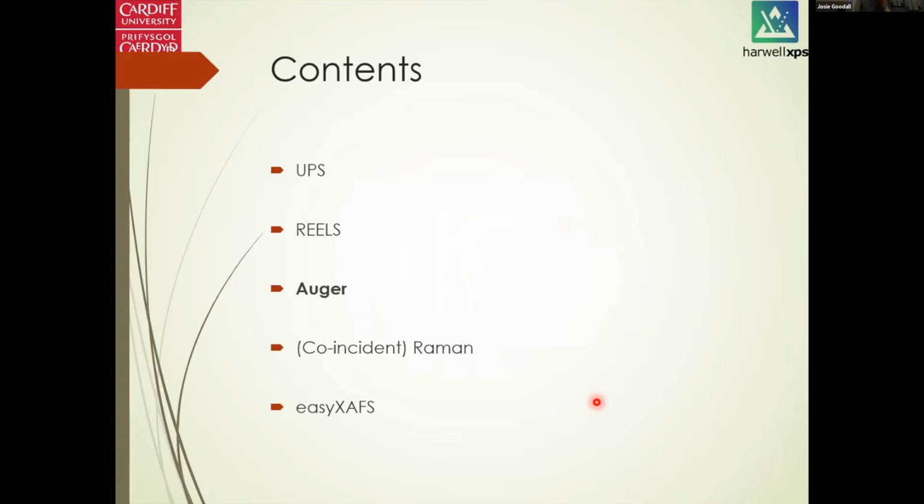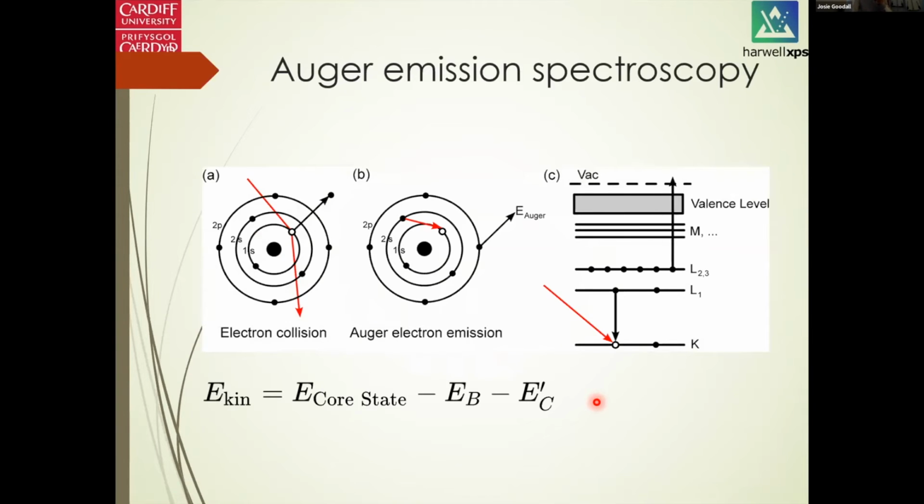Okay, so next one is about Auger. Phil has covered a little bit of Auger. We could see that even in the XPS background. Here, let me first introduce Auger electron spectroscopy.